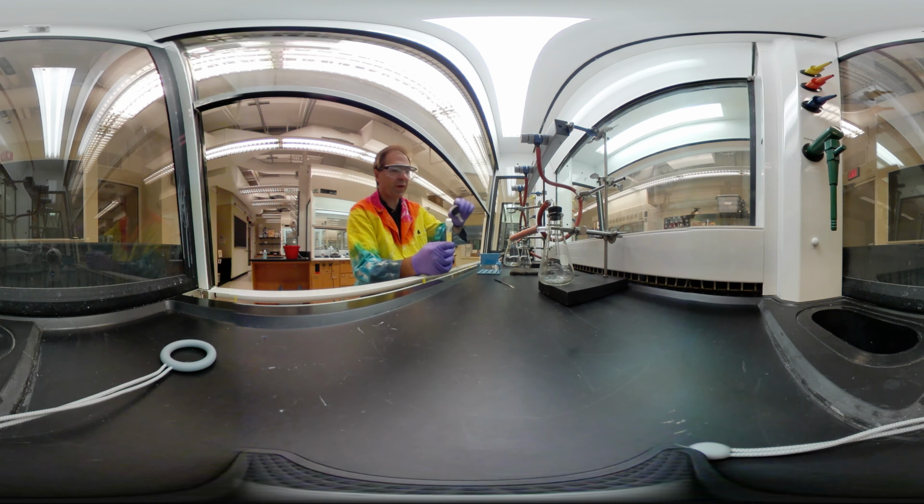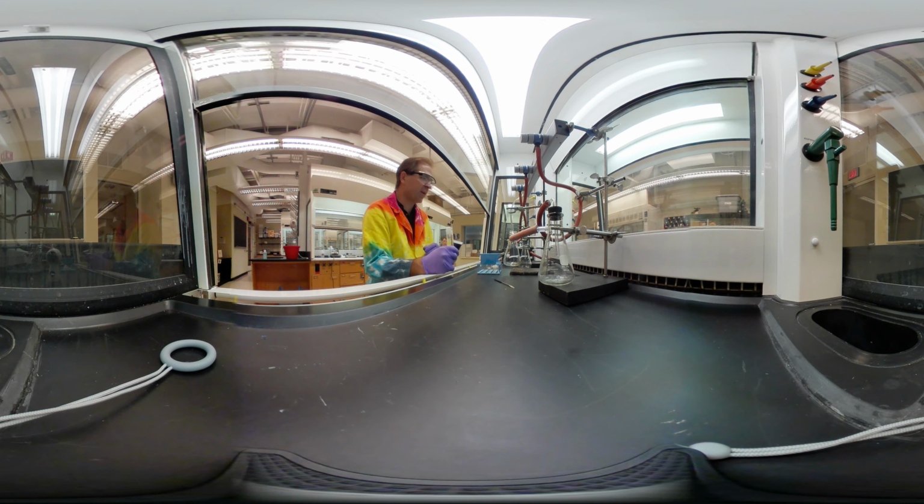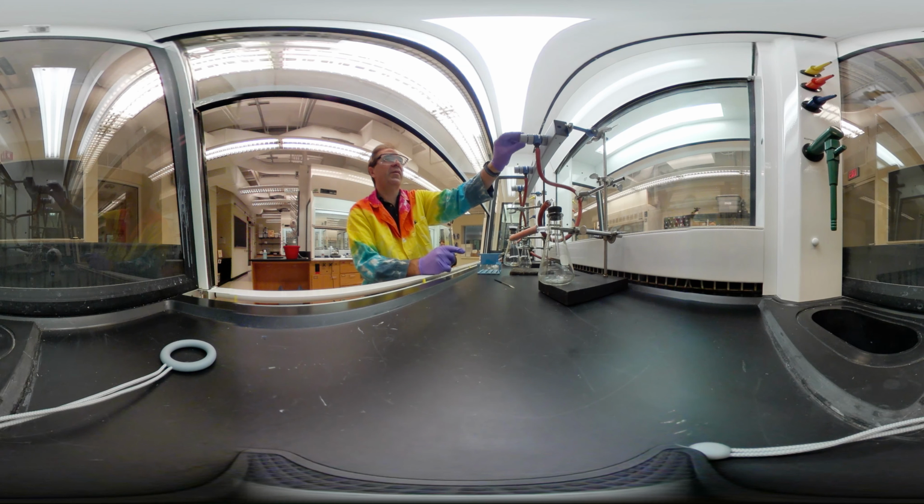So I'm going to use a Hirsch funnel. Looks like it should be approximately the right size, but I have a bigger volume. So instead of using one of these little guys, I've got a much bigger flask on here to collect that volume so I don't have to replace it. However, the Hirsch funnel doesn't seal with that very well, so there's a rubber adapter on there for that. All right, we're on the vacuum. Get our vacuum going here.